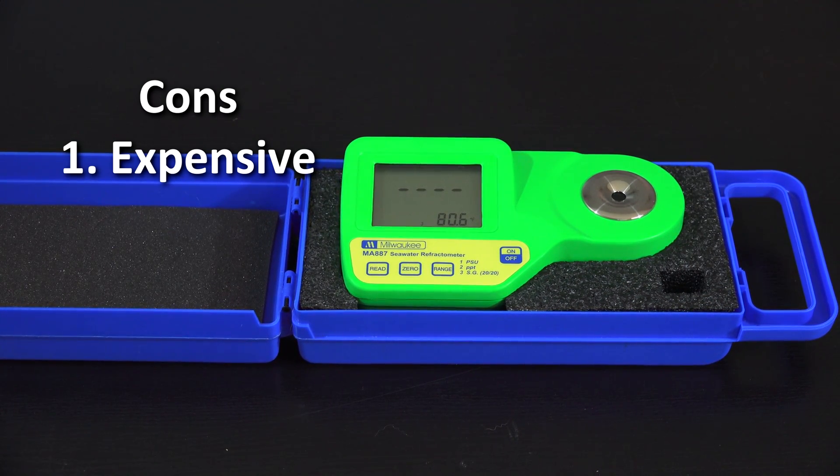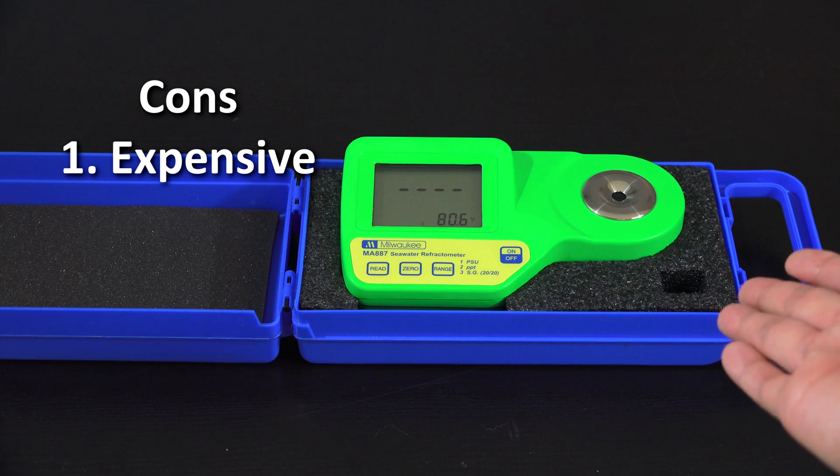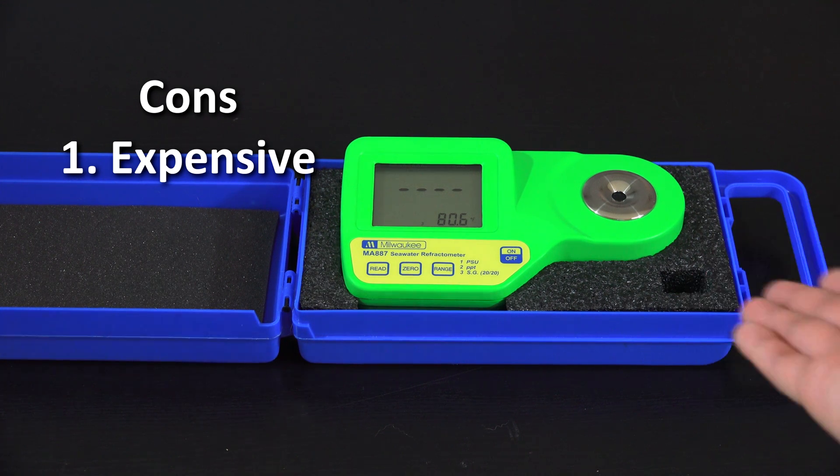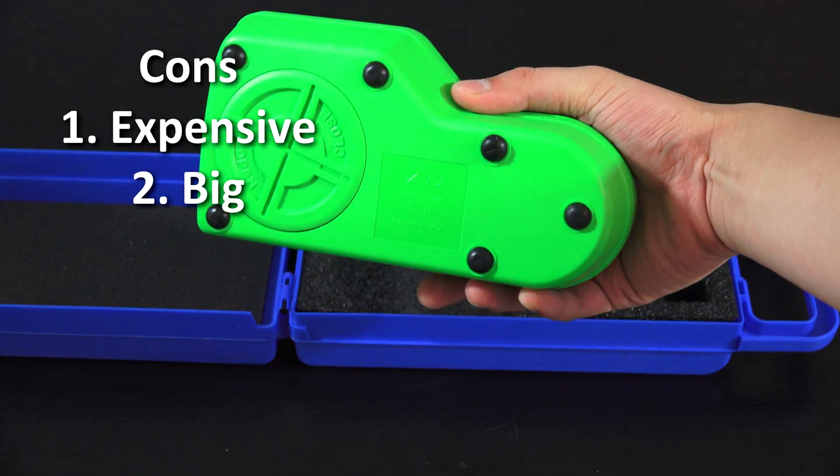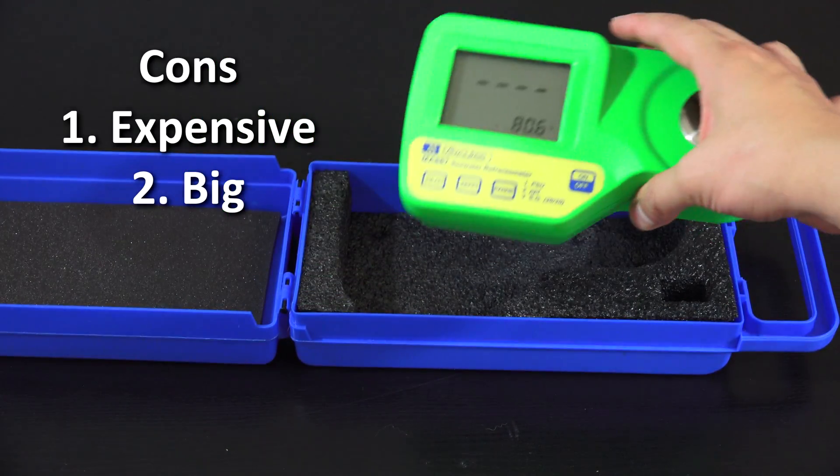The second con is it doesn't come with a case — you have to buy that separately, which kind of sucks. And this unit is definitely a little bulkier than normal analog devices, so storage can be a bit harder.